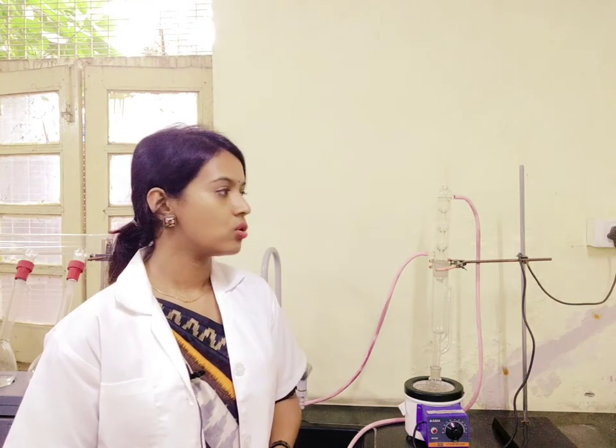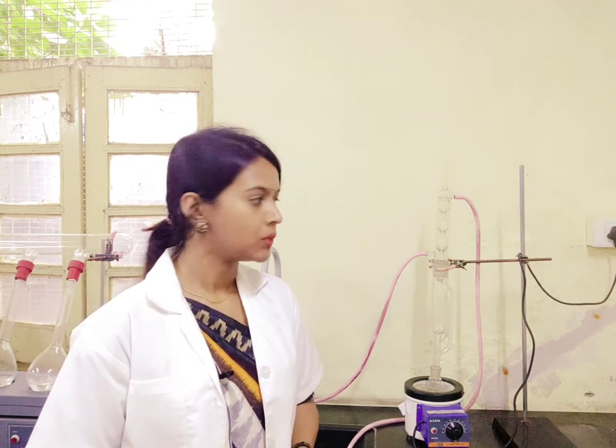Let us talk about the next instrument which is a Soxhlet apparatus. This type of apparatus we use mostly in order to extract fat from any food sample.